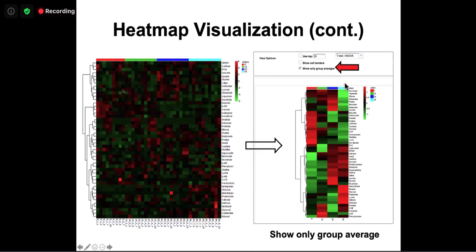For example, here I only cluster the features and not the samples, just ordering them by their sample class. So you can see some variations across different class labels. If you mess that up, it is probably not so good for visually detecting patterns. If people want to show the group average, it will just put the average there and replot everything. Sometimes people want that, especially when the replication is not so consistent, so they try to do some hiding. But I want to see the whole data, every feature across all samples. Once you do the average, you are not sure whether it is meaningful or not.